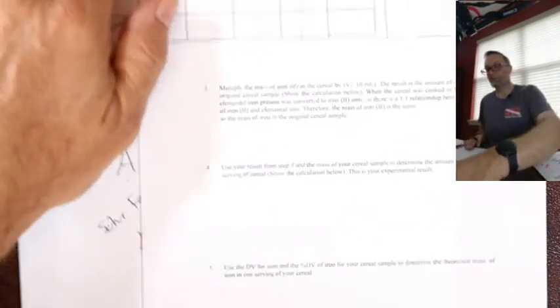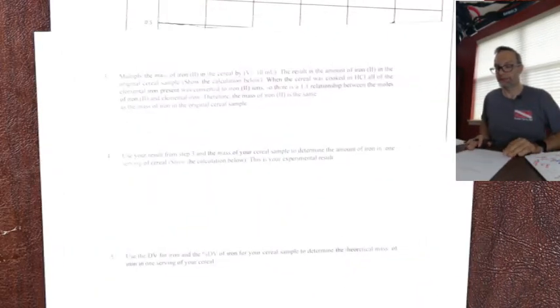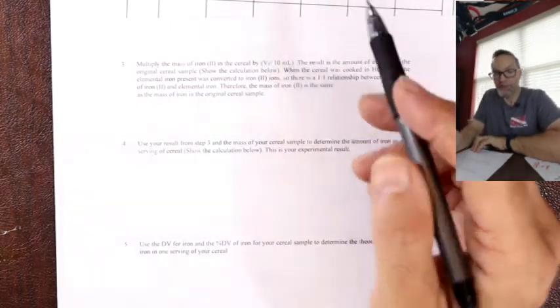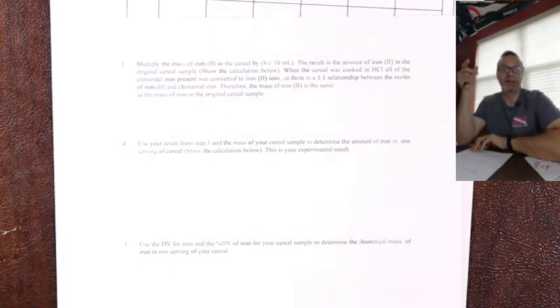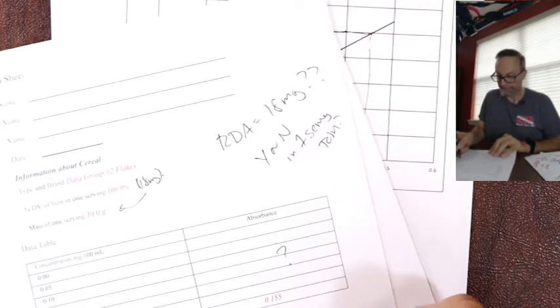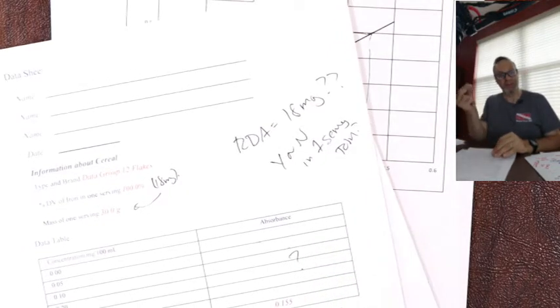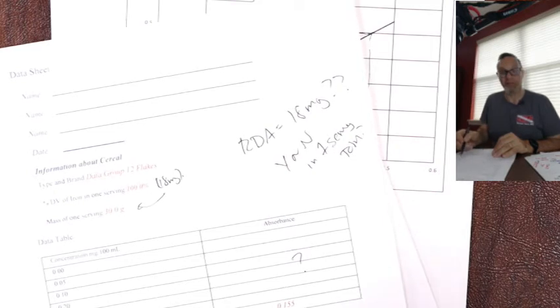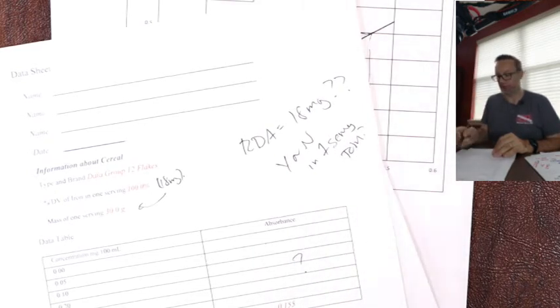Equation. Okay. Now, this is where you have a slight experimental trick. When we drain the iron solution from the cereal, we get a big volume. So we actually recover in this experiment 85.5 milliliters. We drain it like a tea bag, all the liquid out of our iron when we've digested it, and we get 85.5. So all the iron from that 1 gram is in that solution.